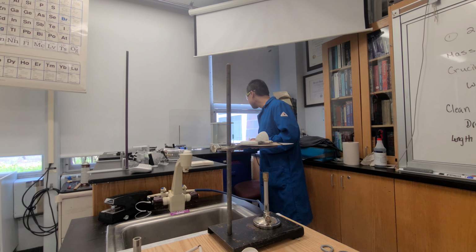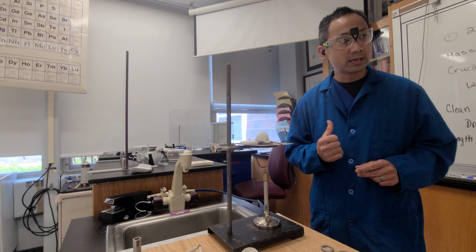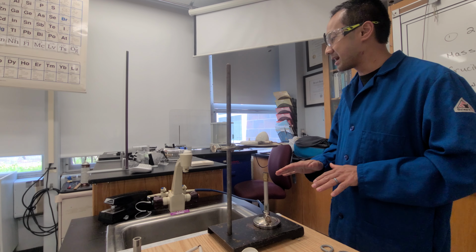I have an analytical balance. I'm going to tare that off. What I'm going to do is get an initial weight. I'm going to be placing everything down over here.